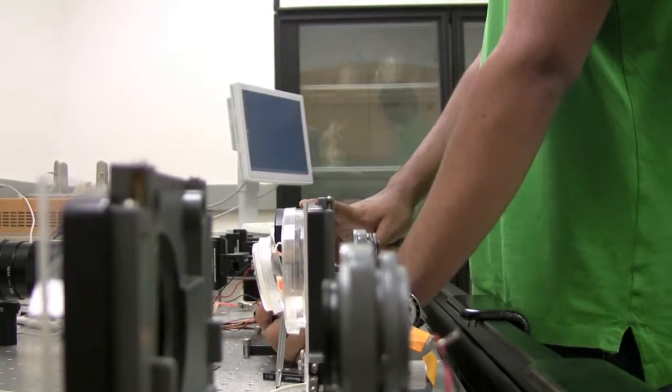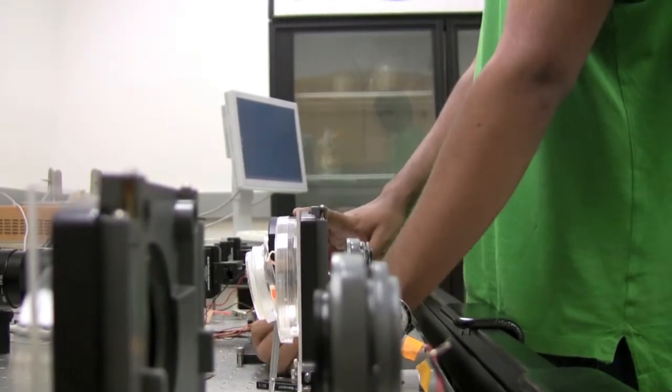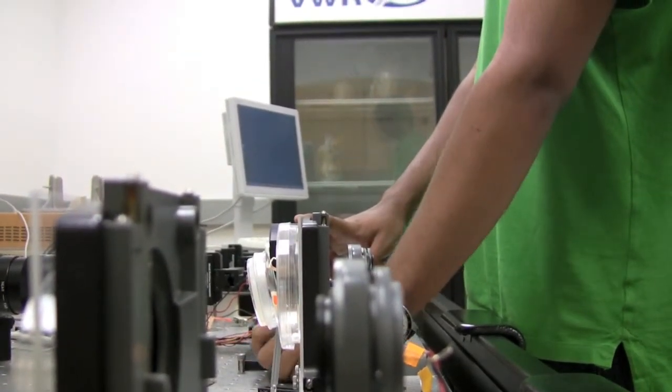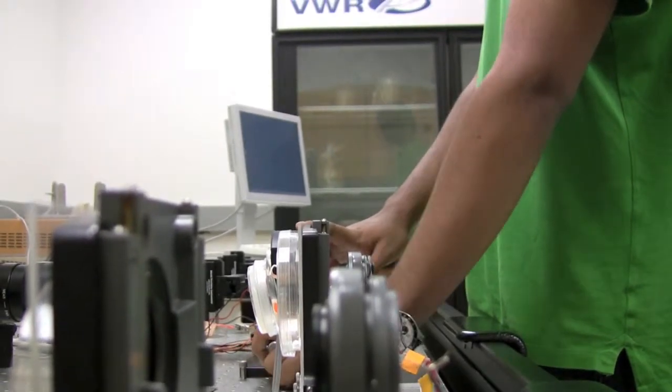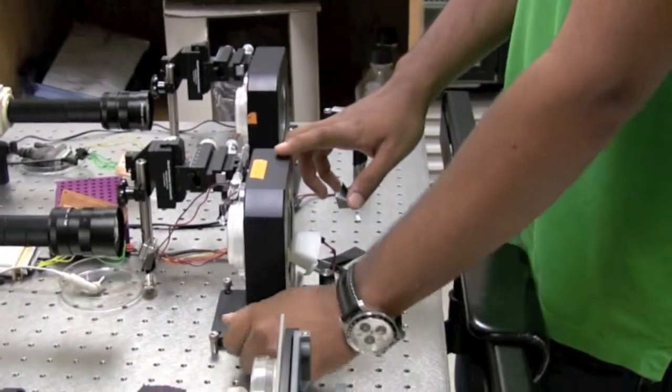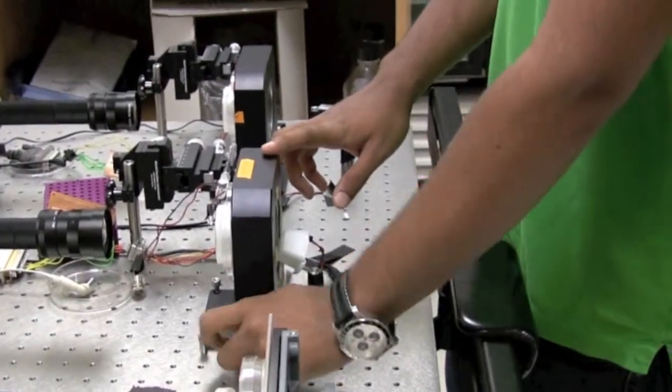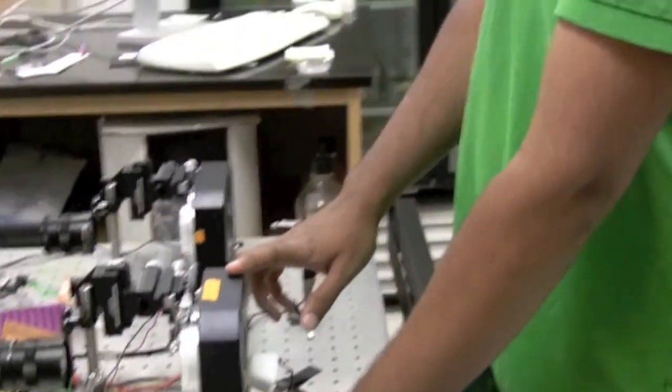The most interesting part of the process is basically the rotato, the machines in there. We call them rotato machines. And what they do is we set these roots up on the rotato and we rotate the motor, which actually stimulates the root at an angle. So we set this up at different angles.